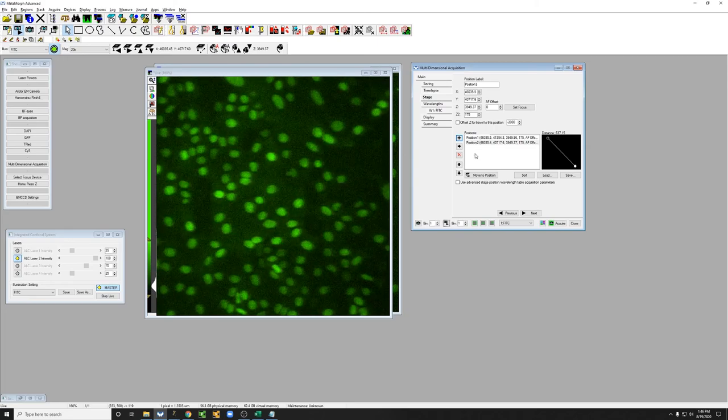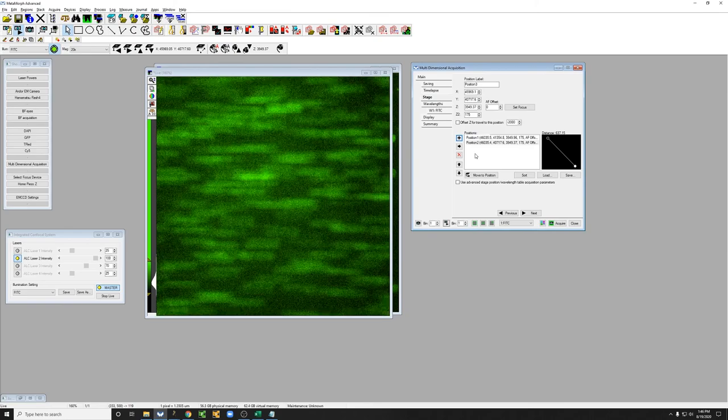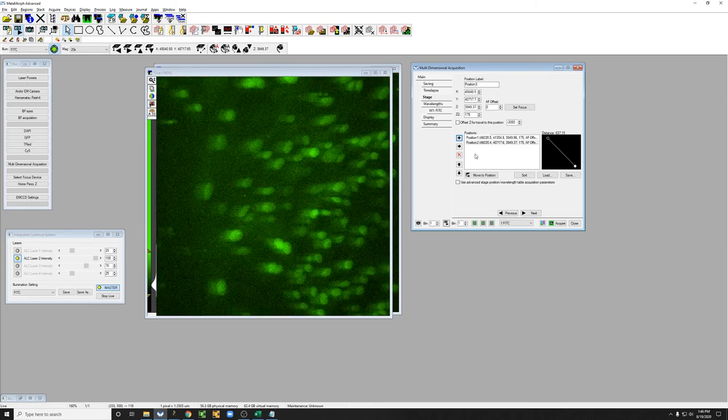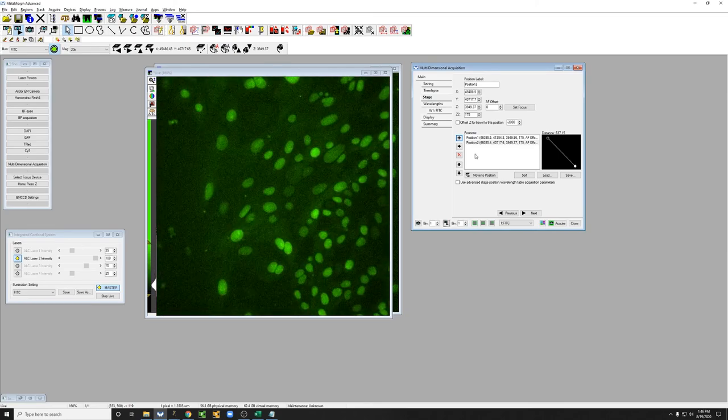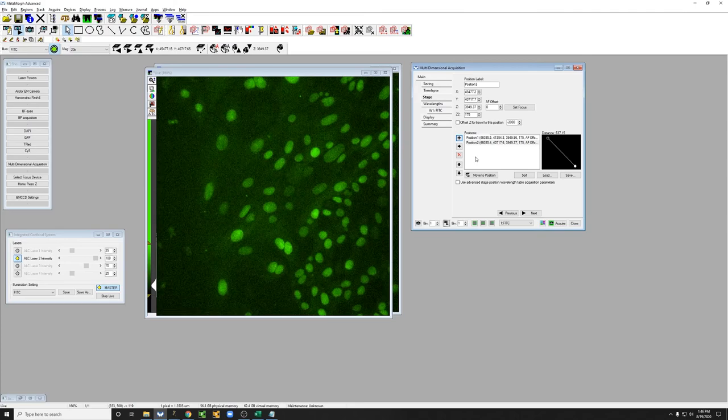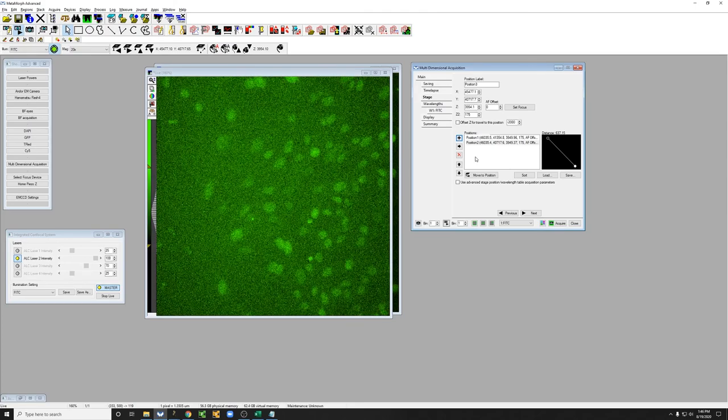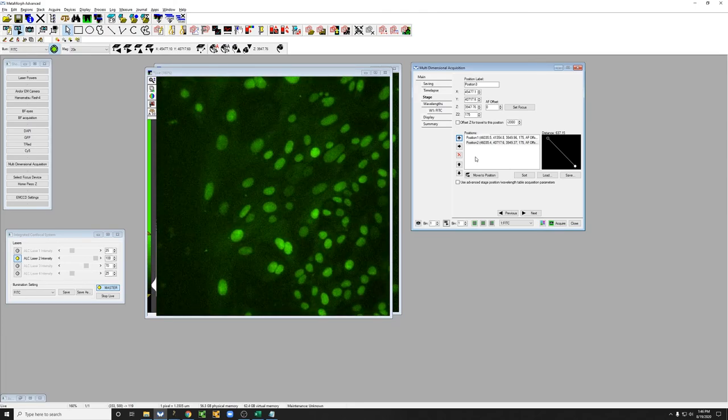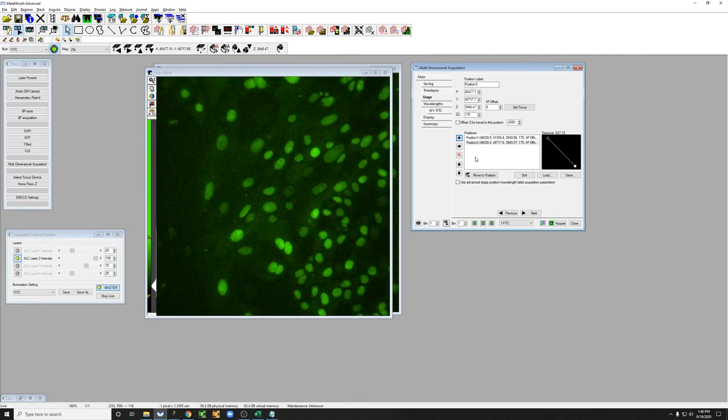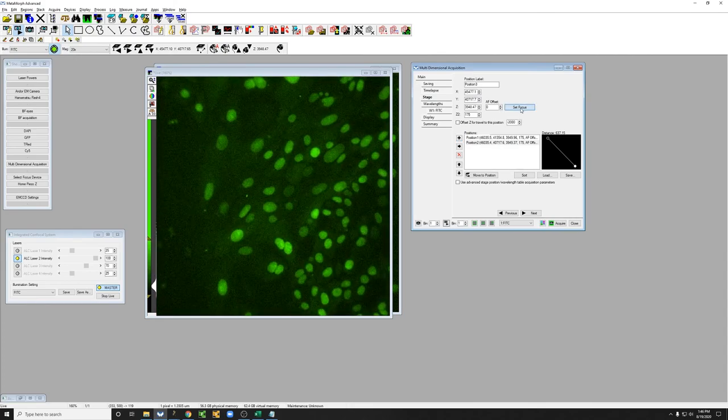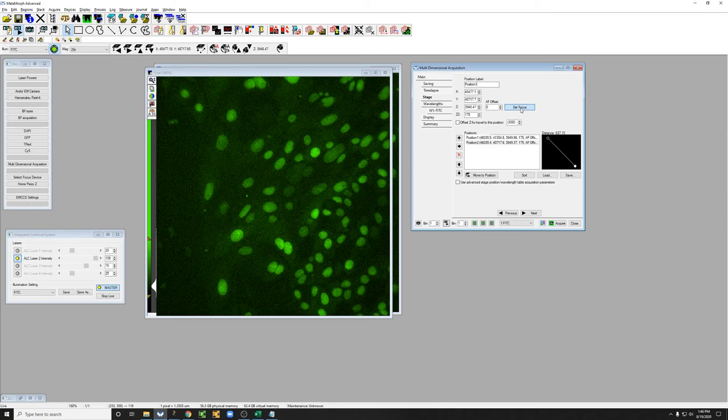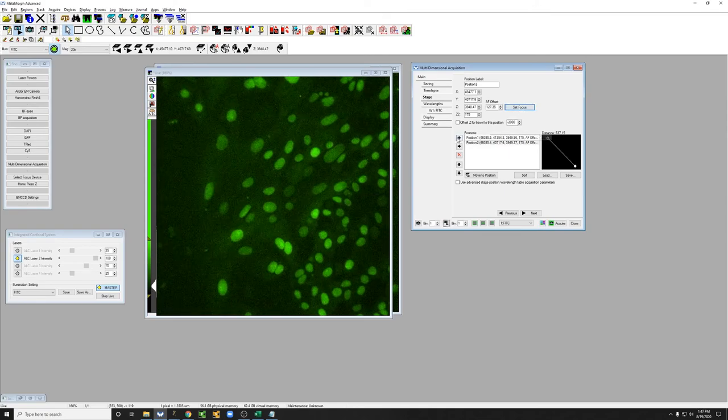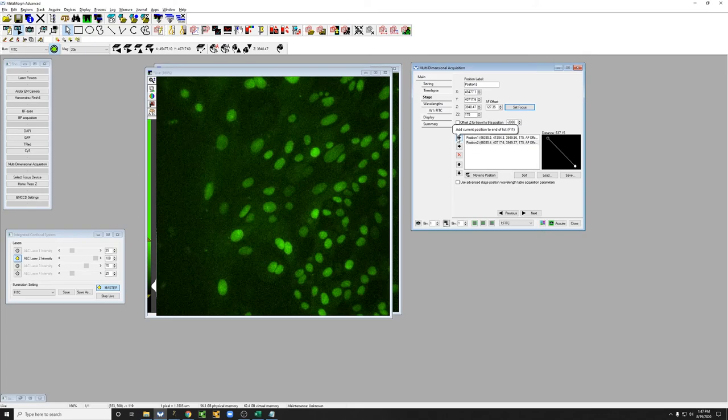I'm going to do one more, a little bit off to the side. I'm going to adjust the focus, make sure it's okay. Click on set focus and add another position.